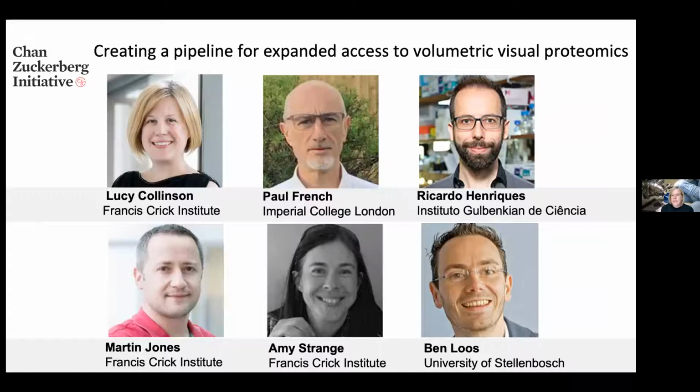So one major aim of this is there's no point in us developing this if it's going to stay stuck in our lab. These advanced imaging technologies are amazing, but if they're only available to a few researchers to answer a handful of research questions, then it's not really reaching its full potential. So this pipeline for high resolution CLEM that we'll be developing should be, and that's a massive aim and a massive challenge, deployable in any light microscopy facility without the need for an expert electron microscopist. And that's what we're going to be working on for the next 2.5 years.